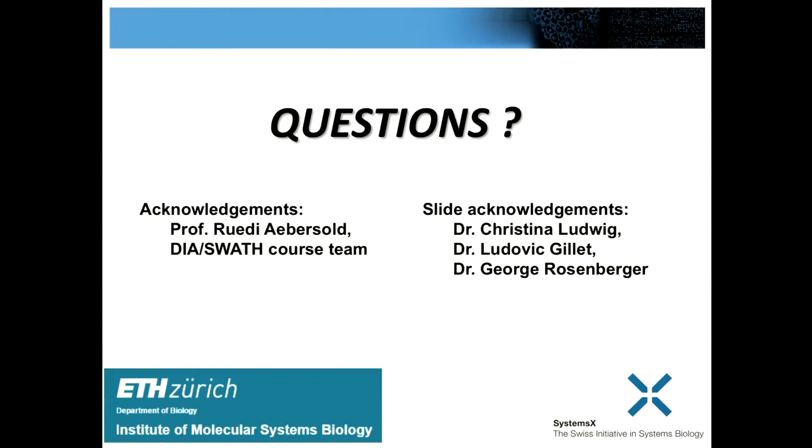Yes, that is very correct. So what you're alluding to is the fact that the site assignment from the shotgun would give us 2 localizations and could be a 3rd. Is that what you mean? So there would be other possibilities on the sequence to consider except those that came out in the library. Whenever you do this manually, for example, or the synthetic peptides, then of course you, in that case, might consider all possible localizations. IPF considers all of them. So in the case that you have several possibly modified residues, it would take all possibilities into account as per specified. So you would need to specify that you would like to consider all serine, threonine, tyrosine, for example. You would not consider the alanine, for example.